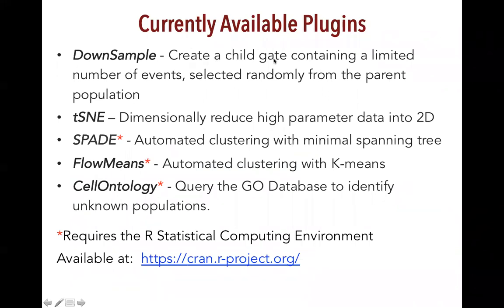Downsample creates a gate containing a limited number of events evenly selected across the entire time slice of the sample — basically a random selection from the parent population. You get a downsample population with fewer events, but it still reflects the same phenotypes and functional properties as the entire file. T-SNE is a dimensionality reduction algorithm that creates two new dimensionally reduced parameters.